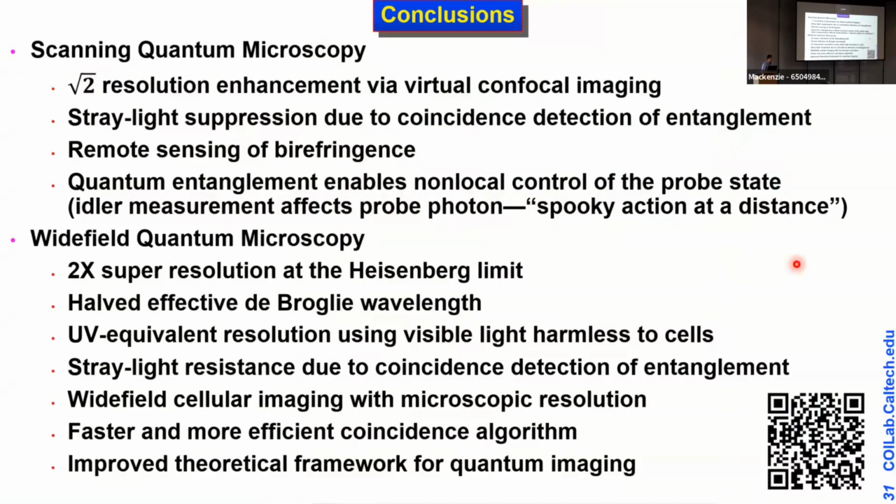I have two questions. The first question is, when people talk about super resolution, there are two kinds of resolution people talk about. One is when you have enough light, it's just limited by your optics, your aperture. The other is when you don't have enough light, it's also limited by the number of photons you observe. So in the super resolution you talk about here, are you talking about the one that surpasses the photon number limit? We assume we got enough photons. Okay, yeah, that's what I feel.